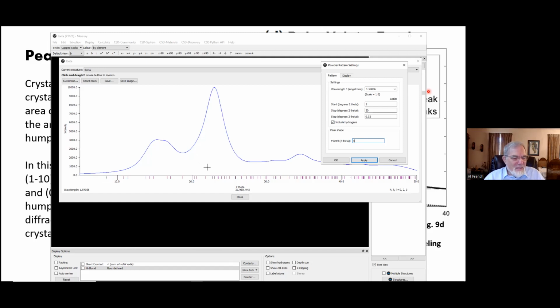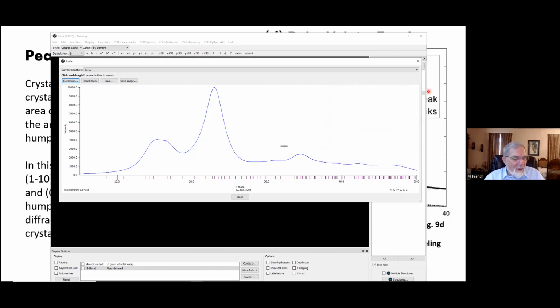Now, the other thing that we can take away from this is, I'm going to get that out of our view here. You see, there are all these little magenta lines where there are actually peaks, and yet there aren't any peaks showing up here, or nothing to really write home about out here. And so if you use the two big peaks here, and maybe the two small peaks here and here, plus an amorphous curve to deconvolute this, you're leaving out all of this information here that's actually crystalline, but you may count that as amorphous material.